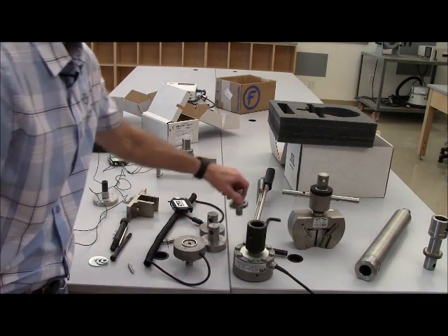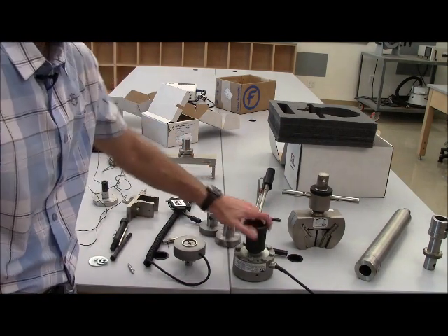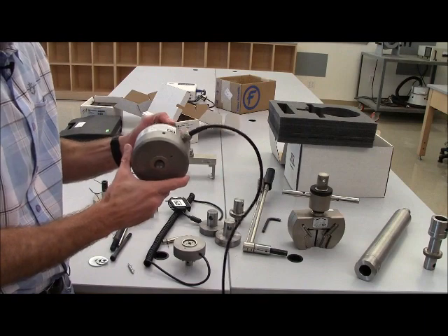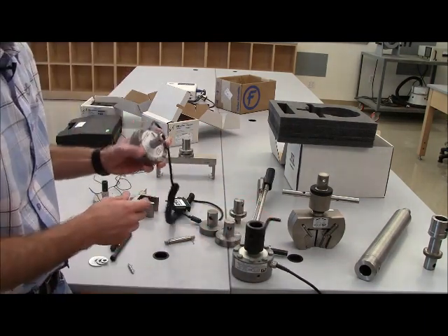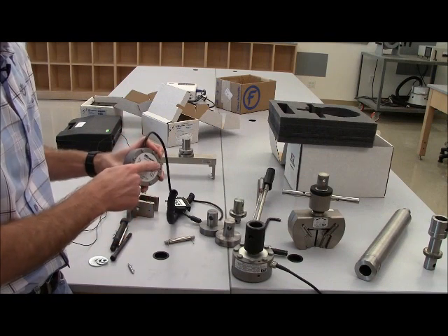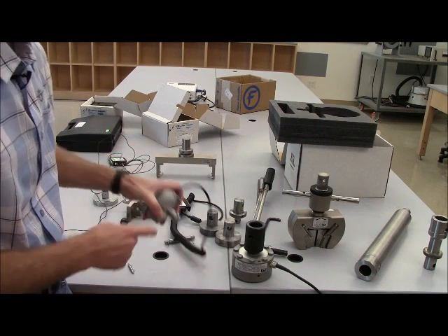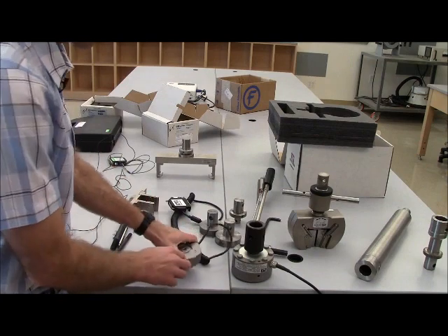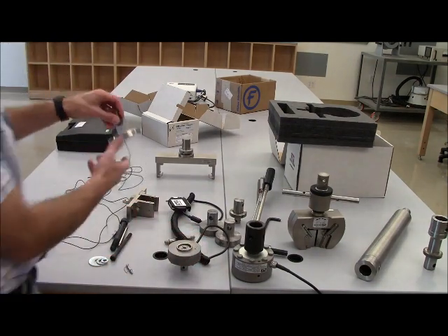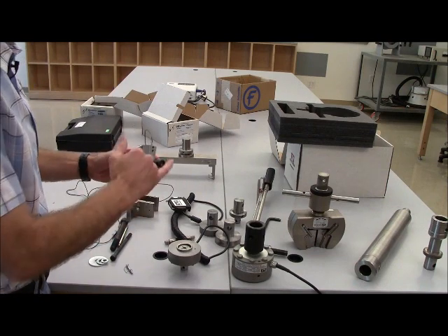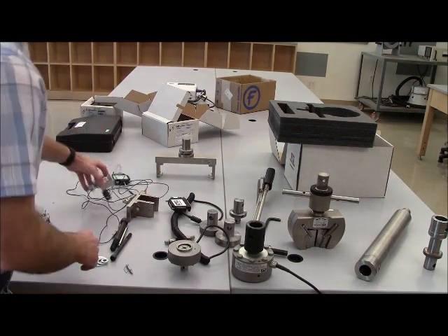As far as load cells go, we have three different capacities. We've already talked about the 50,000 newton. We also have a 2,000 newton. By the way, the 2,000 newton and below have the type OM. And then we also have a 100 newton load cell, the small one here, and of course an OM connection on that.